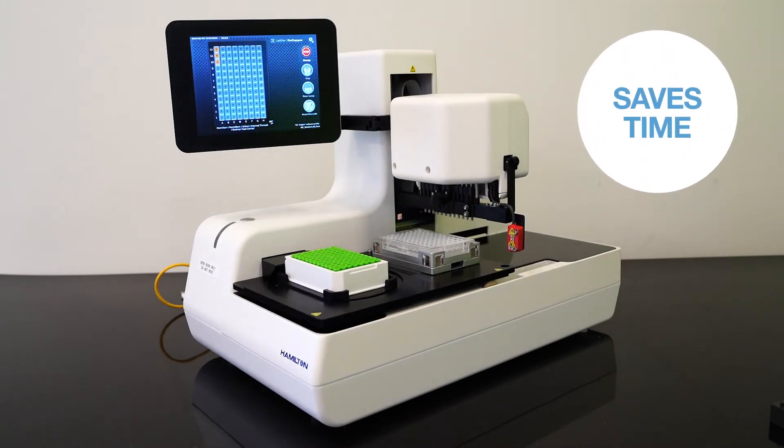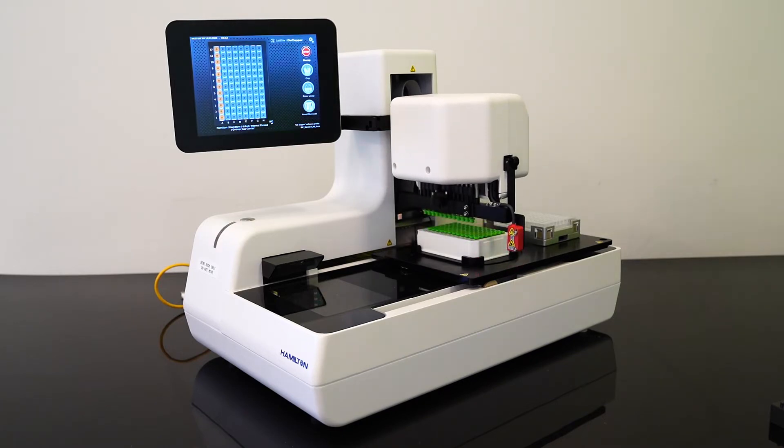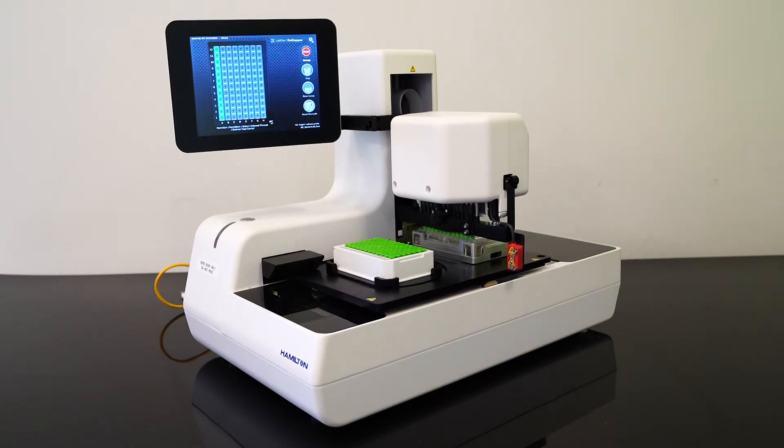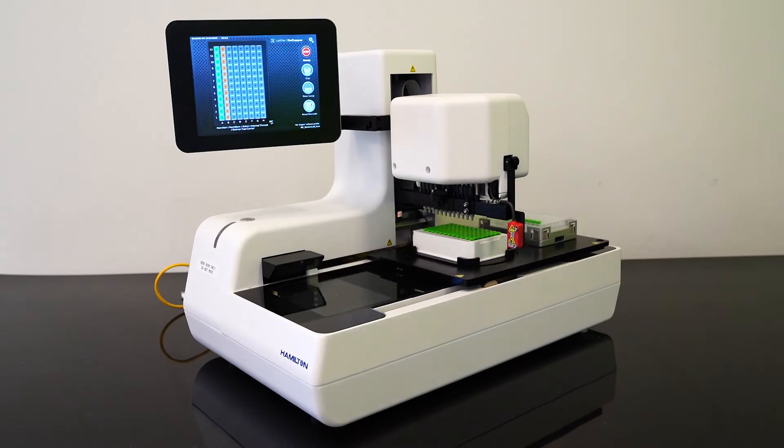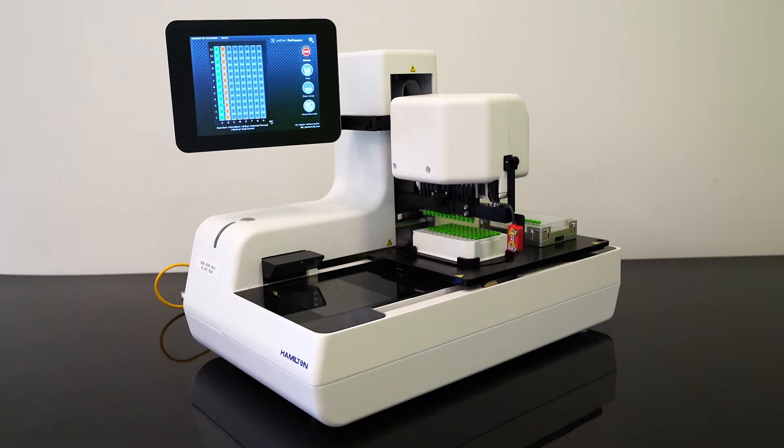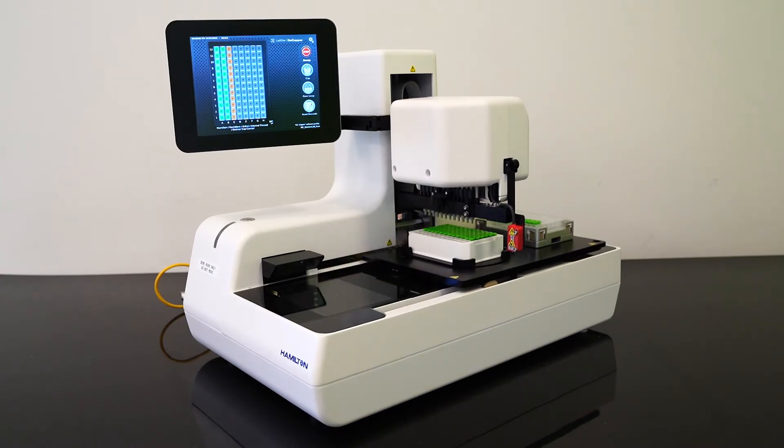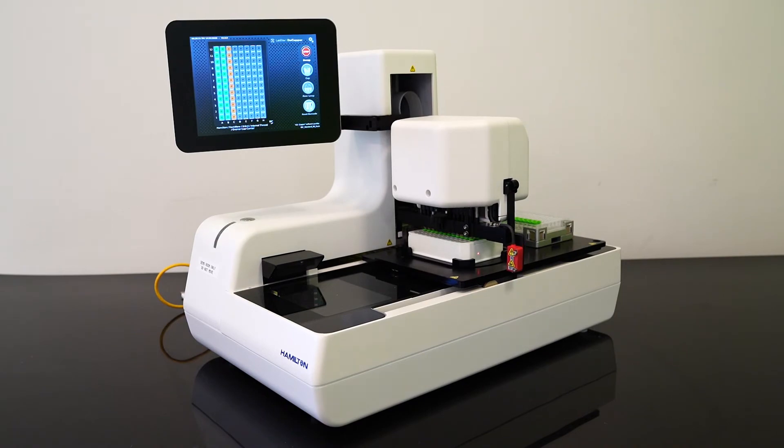One of the most prominent features of the LabElite Decapper is that it saves you an incredible amount of time. You can cap and decap an entire rack of 96 format tubes in about one minute, which you will see demonstrated in just a few moments. The Decapper completes repetitive tasks quickly and accurately, while also removing the physical strain associated with manual capping and decapping.